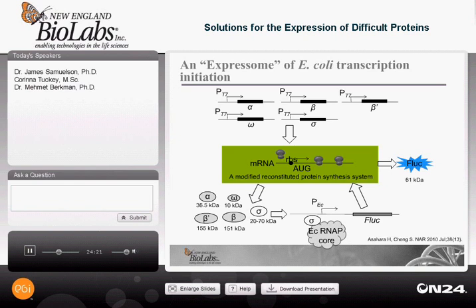The E. coli RNA polymerase core enzyme associated with the sigma factor to form an active holoenzyme, which then read the firefly luciferase reporter gene off of specifically the E. coli RNA polymerase promoter, and we were able to ascertain a readout from the luciferase as a function of formed E. coli RNA polymerase.